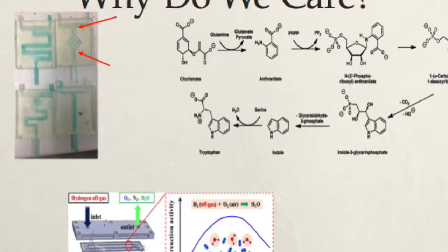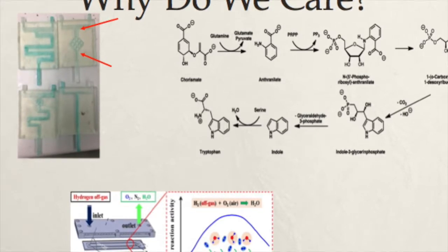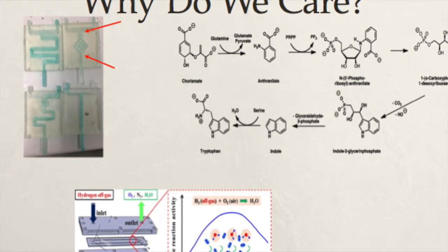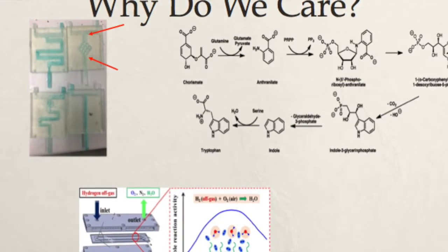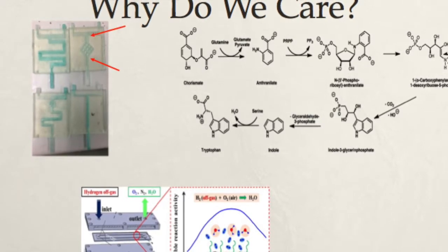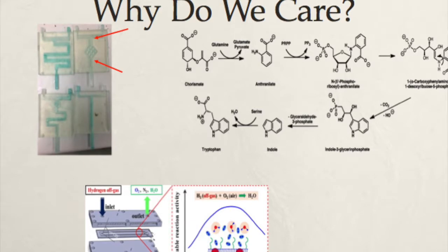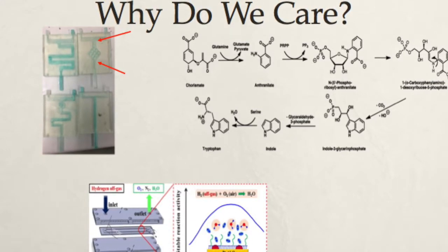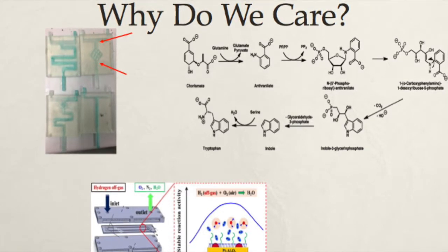Microreactors play a key role when the objective is to synthesize materials faster than the standard batch techniques will allow for. These benefits will occur from the mass transfer that arises along with the high surface area to volume ratio common in most microreactors. Along with these factors, microreactors provide better energy efficiency, reaction speed, safety, and allow for ease of design and scalability since most can be made and manufactured on site. Therefore, microreactors are the preferred tools in hydrogen generation from fuel and bioreaction studies.